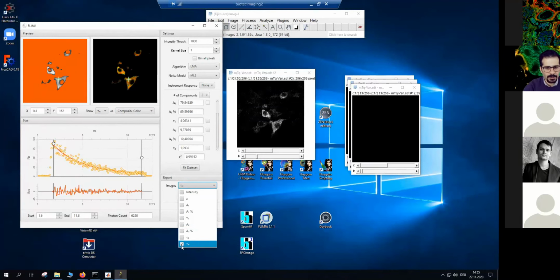They see that it's working quite nice, and also the values that I'm finding are quite different. But I was expecting to see the tau one about 3.5 nanosecond, but now it is fitting. This plugin is telling me the long lifetime of my donor. This means that unquenched donor is actually 4 nanosecond. So I have to come back to that and check it. That's why it is like this.